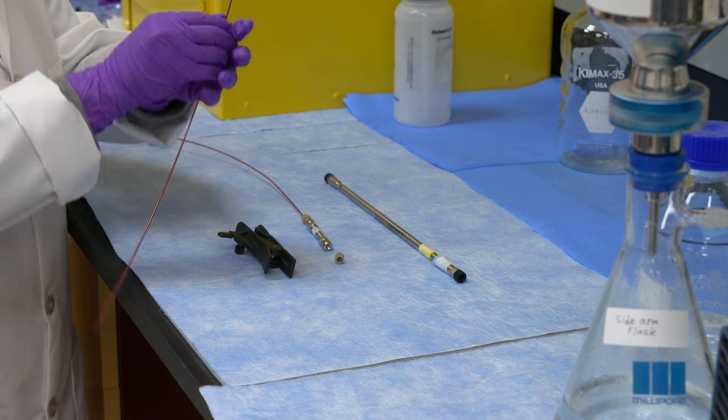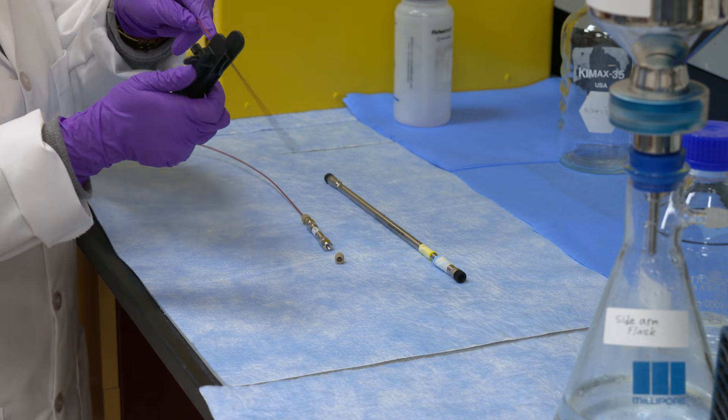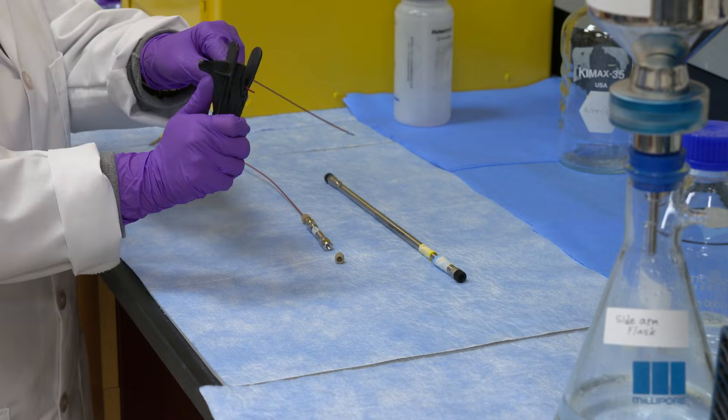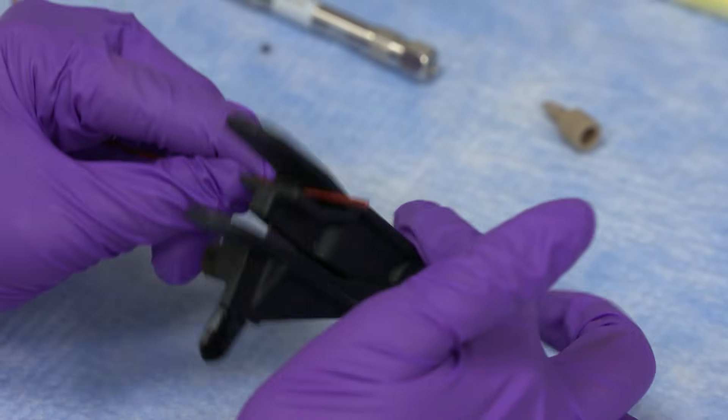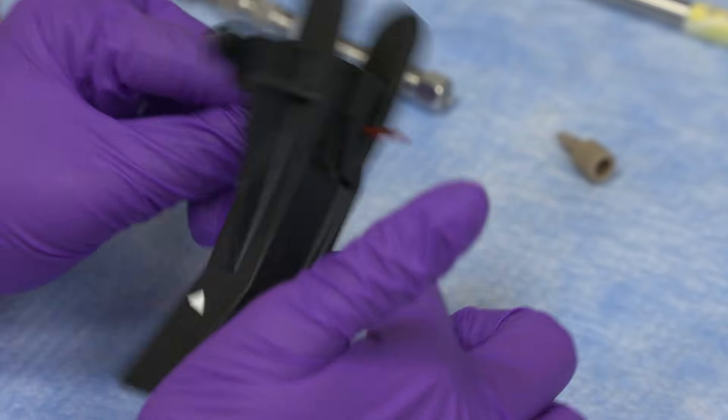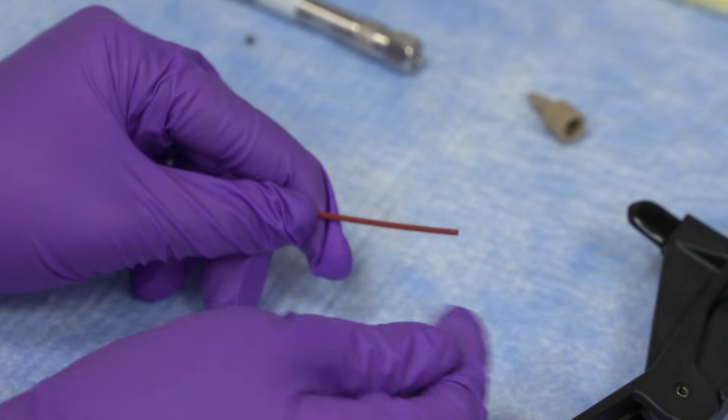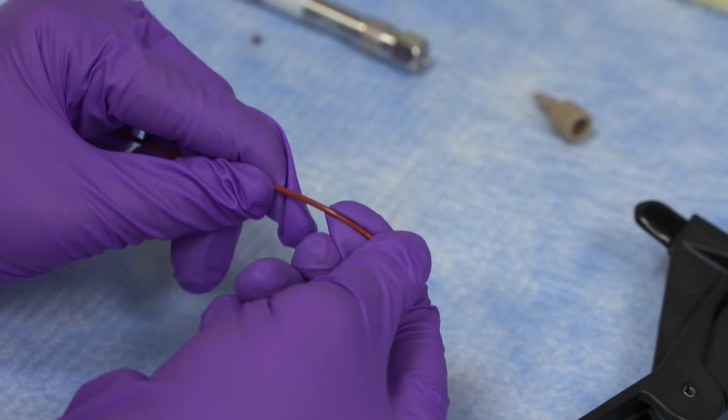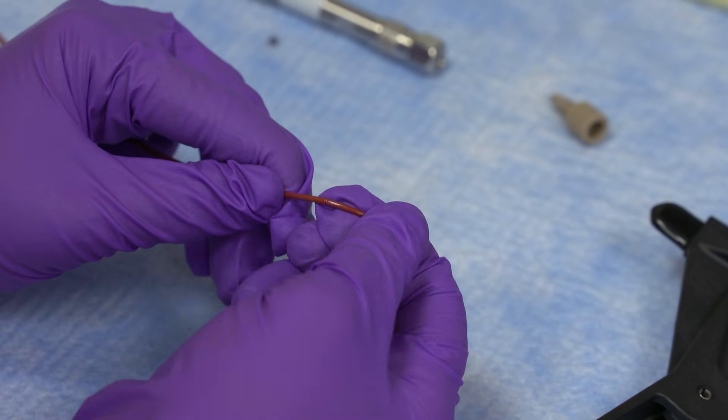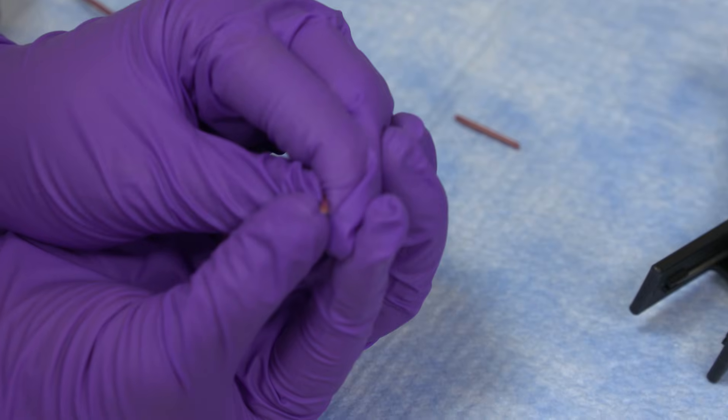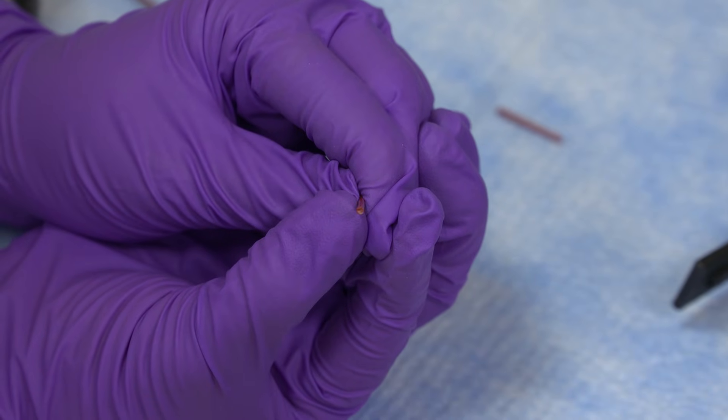You'll take your peak tubing. To cut it appropriately, you insert it in the cutter. Instead of cutting it, you spin it. Now snap the peak tubing in the site it was cut at. This gives you a nice round shape that you can insert in the ferrule.